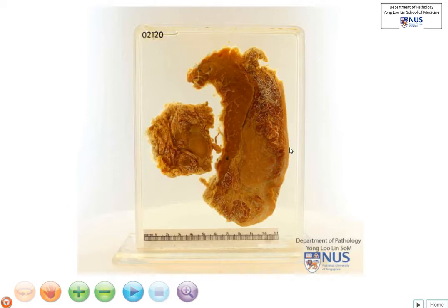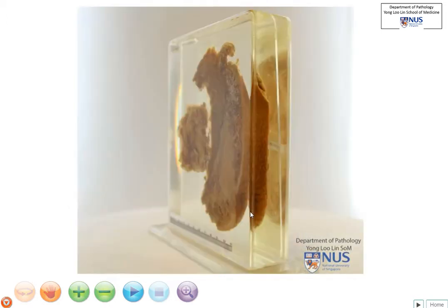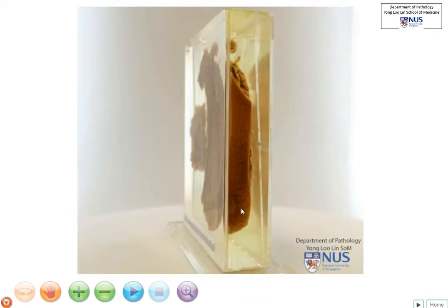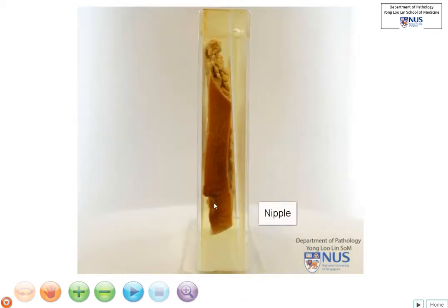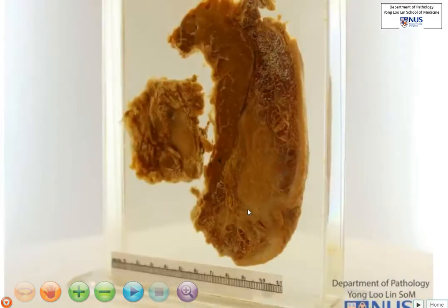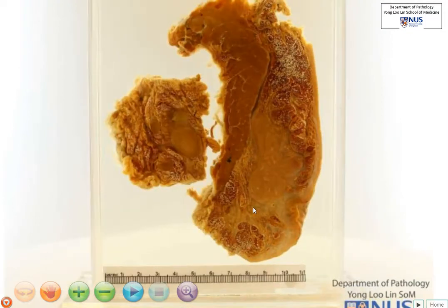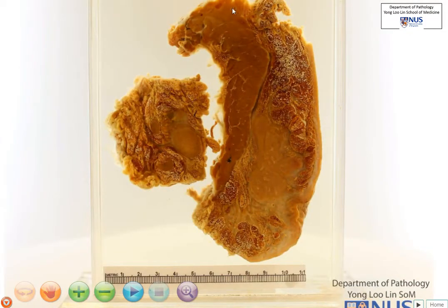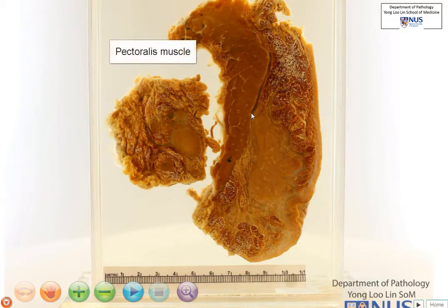Overlying the breast, of course, is the skin, and it appears that the nipple is included as well. Then there is the breast parenchyma, and there is, deep to this, the skeletal muscle of the pectoralis.